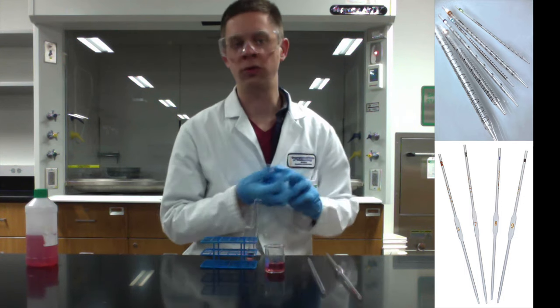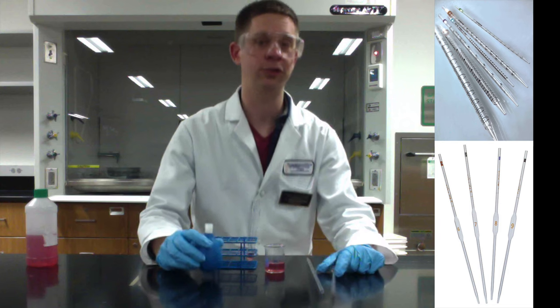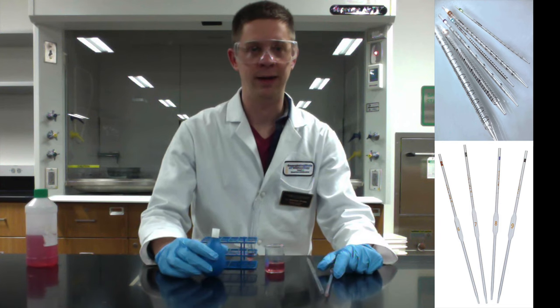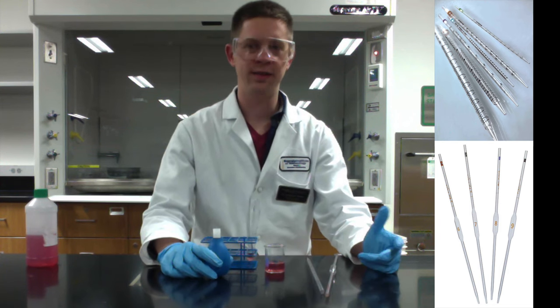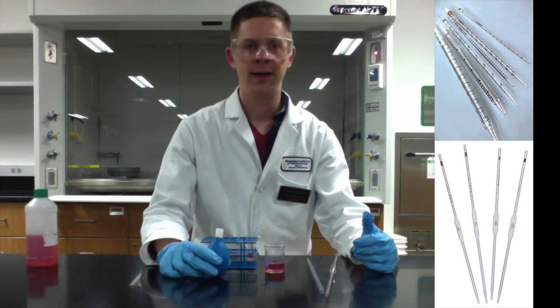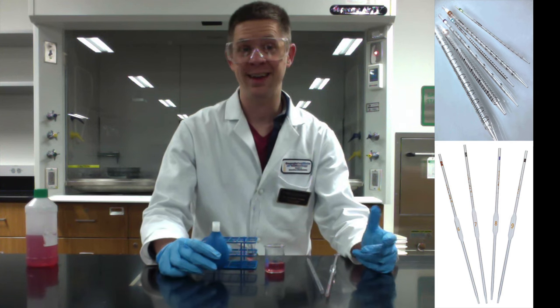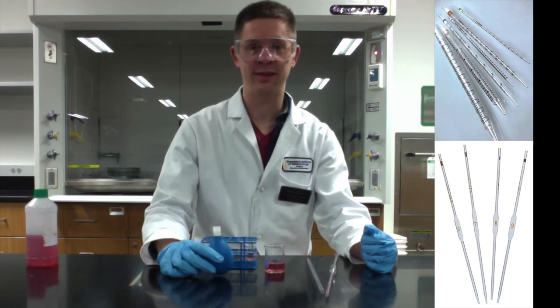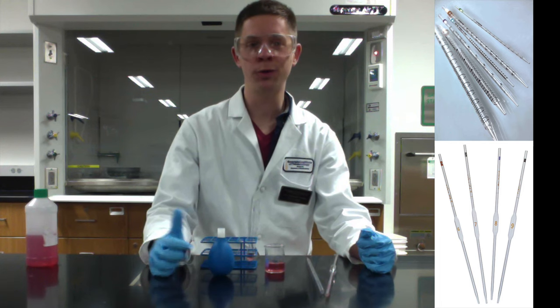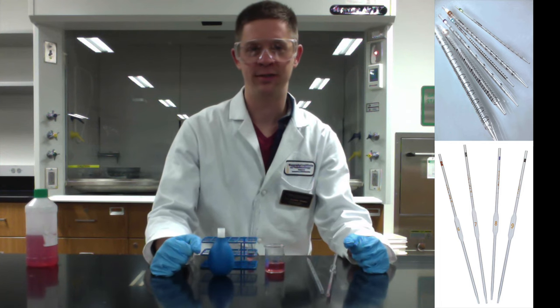Like I said before, don't let pipetting be a barrier to your success in chemistry lab. If you use proper technique, you can avoid things like air bubbles and systematic errors, parallax errors, and stuff like that. So be careful when you're pipetting to maximize your chance of success in the lab.